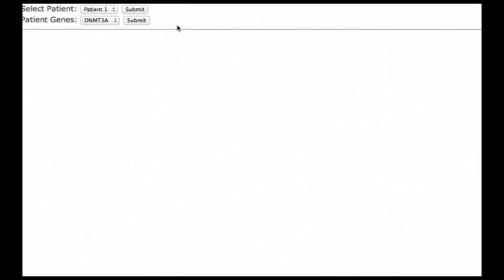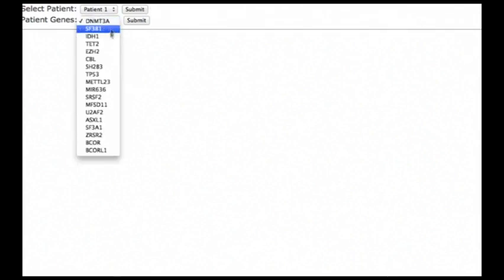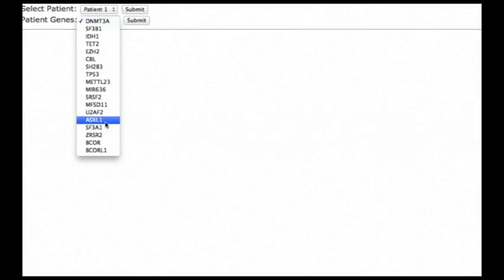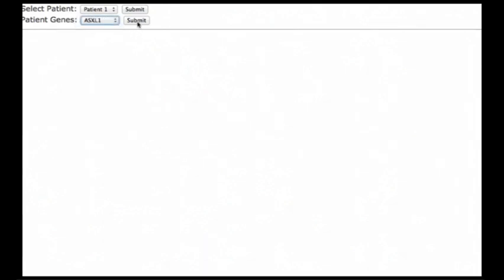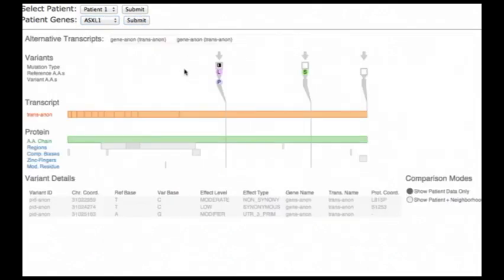VariantView also allows analysts to compare one patient to a large dataset of harmful variants for a specific disease. We select a patient from the top and one of the genes the patient has variants in. This patient has three variants.